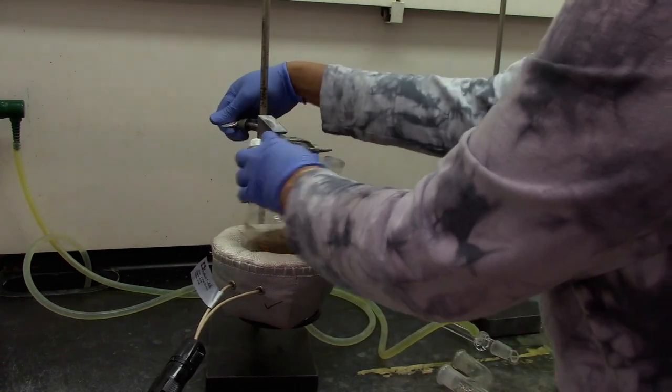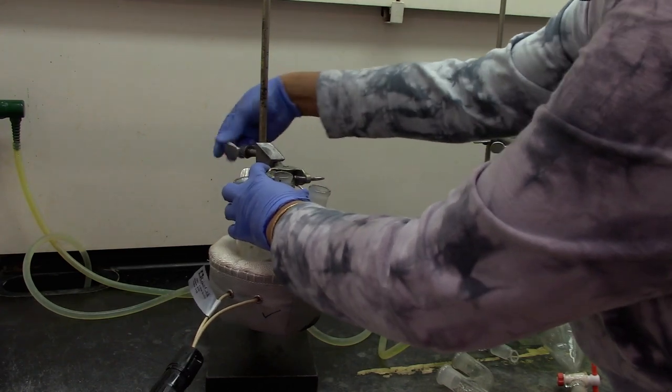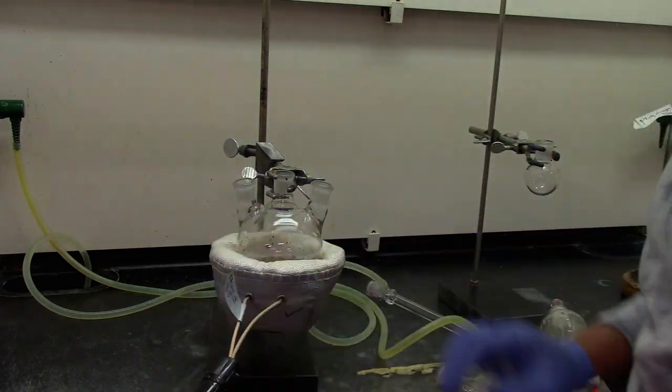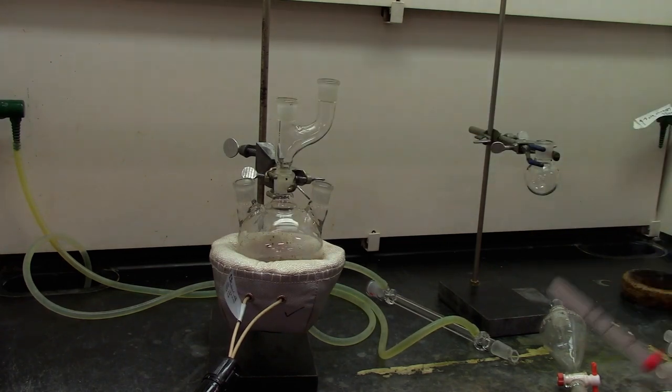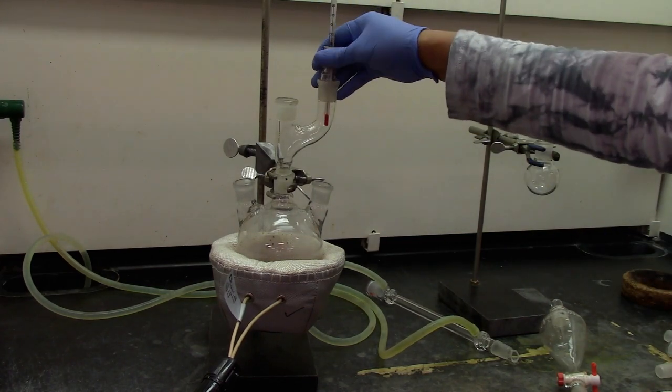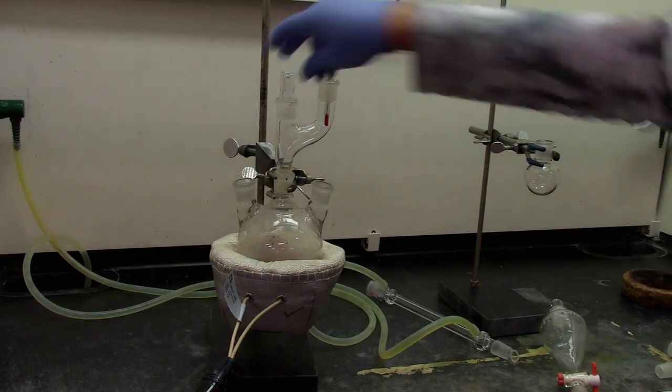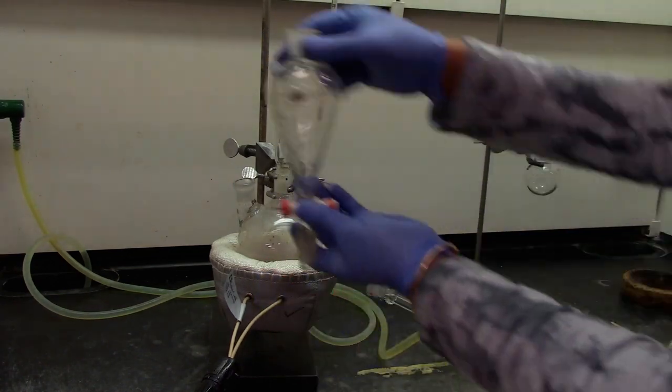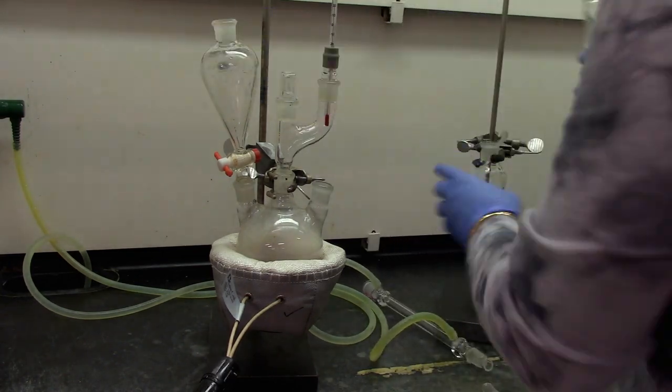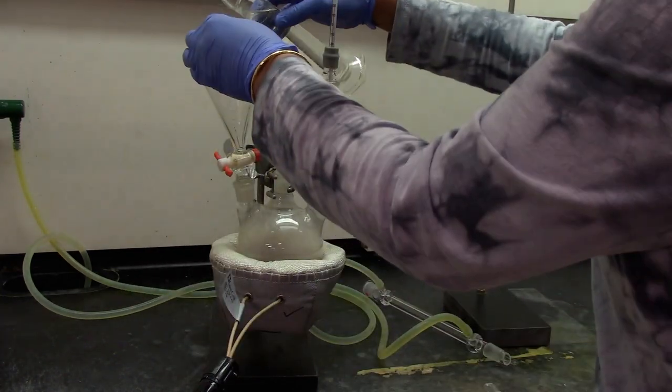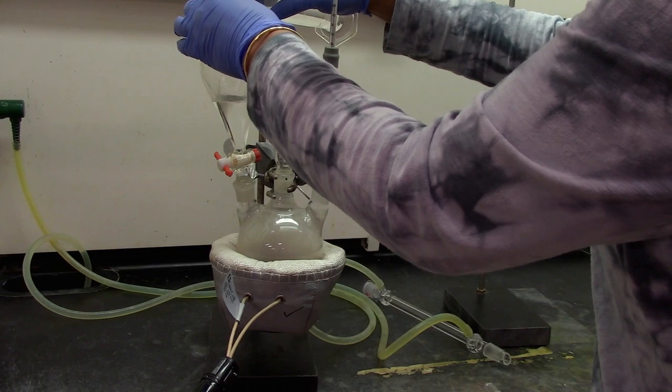Go ahead and clamp the 500ml round bottom flask and lower the round bottom flask into the mantle. Attach the separatory funnel and add 100ml of DI water.